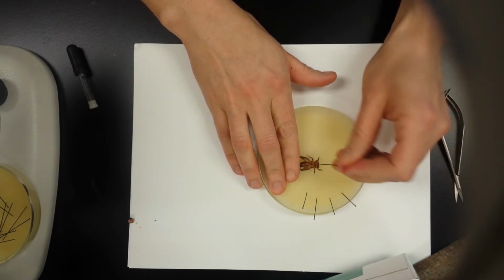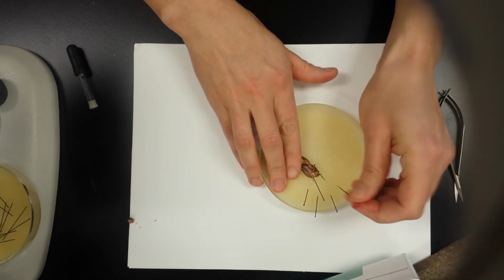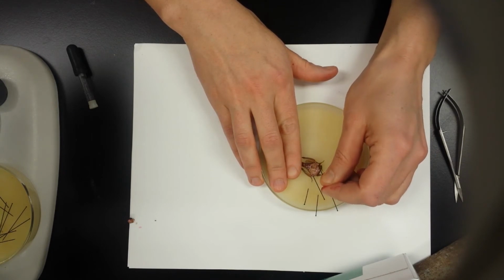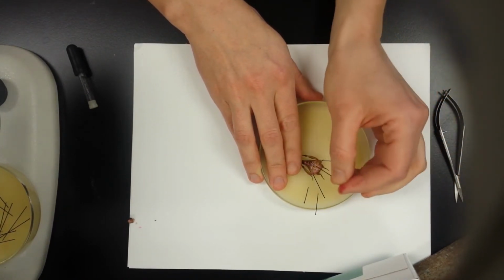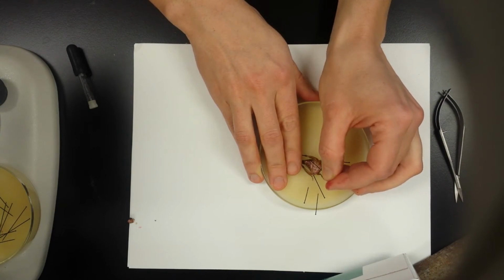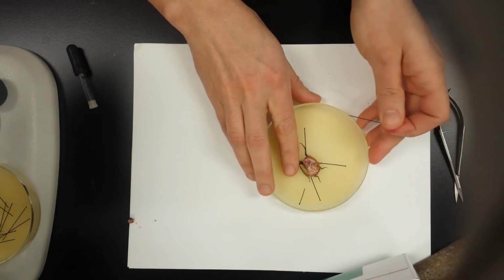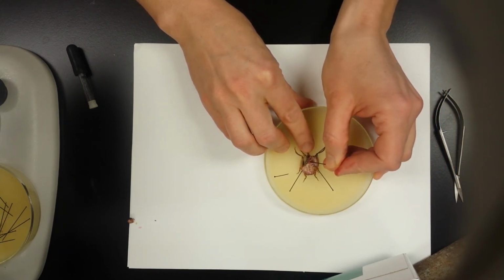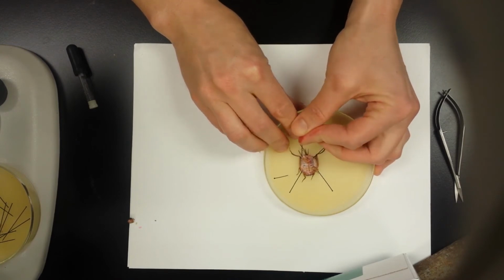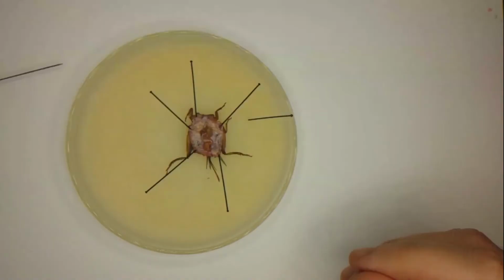Okay, and then I will pin open her body cavity using this set of insect pins here. And in this case, it looks like this is actually a flight-capable cricket that has metabolically active flight muscles. I'll be pointing out some more details of her internal organs when I switch over to a slightly higher magnification.